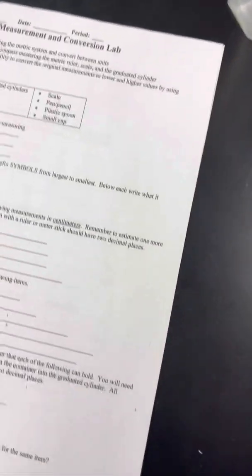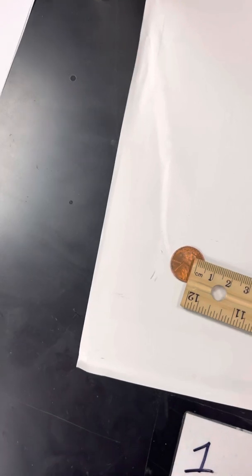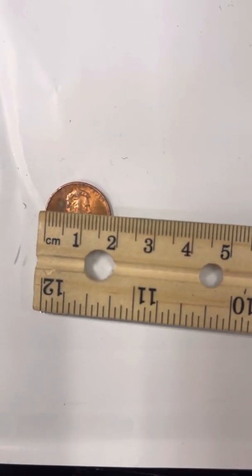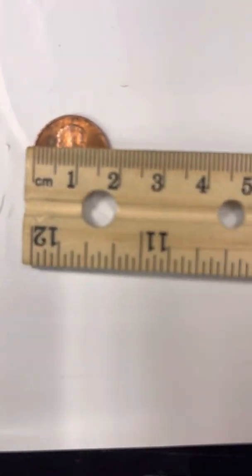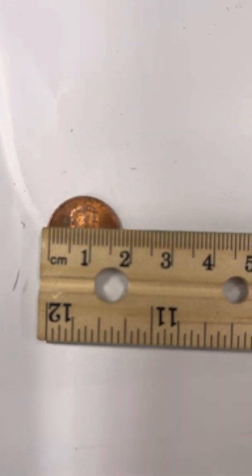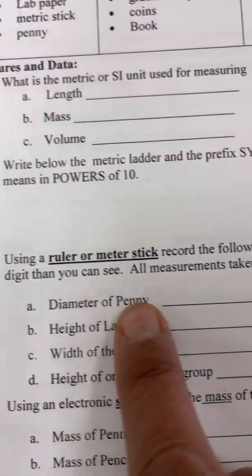Okay, so here's our penny, right there. And this side is the centimeter side. So let's look at it closely. Right there, it's about 1.8 centimeters. 1.80 centimeters. Okay, that's for the penny, and that's what you put for that one.